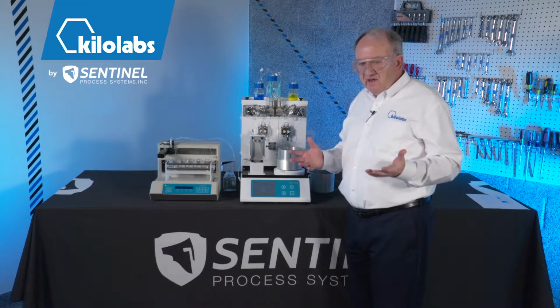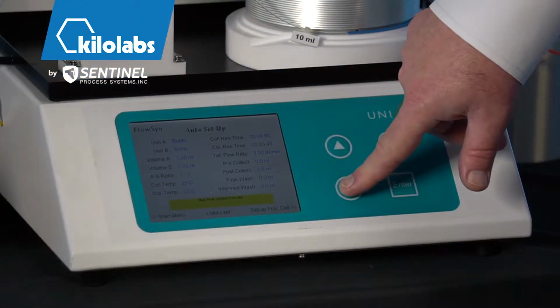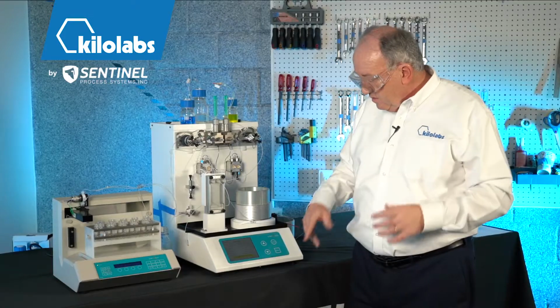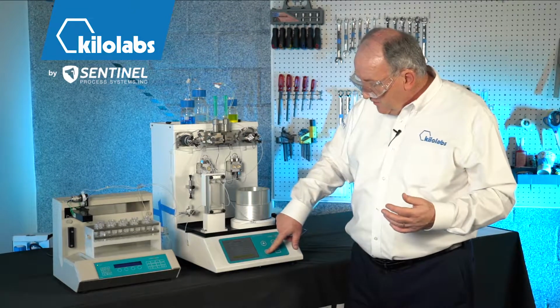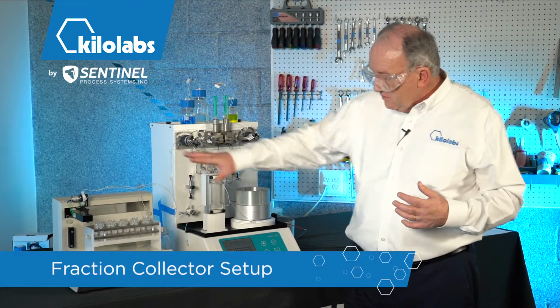So if you've got an idea of the conditions that you want to run at, this is that pre-collect and post-collect volume that I talked about, where you're looking at the reaction plug and then determining whether or not you want to collect all of the dispersion. Then there's the final wash volume and an intermediate wash volume, and the next step is to set up the fraction collector, which is over here.